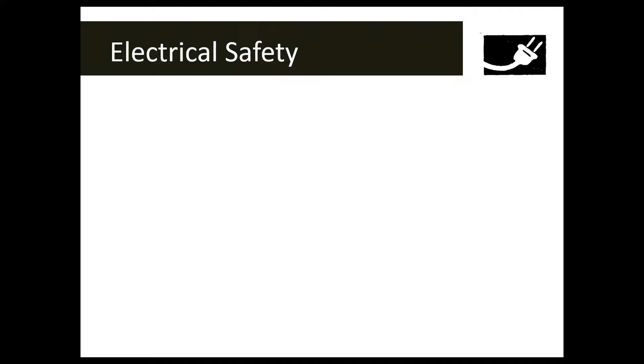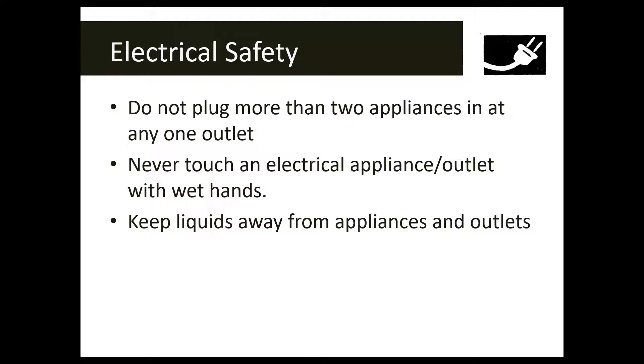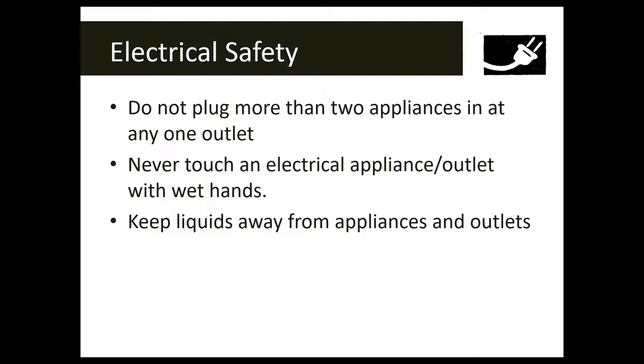Electrical safety means we're going to be working with electricity. Don't plug more than two appliances into any one outlet — we don't want to overload our electrical outlets. Never touch an electrical appliance or outlet with wet hands, since electricity and water are not friends. Keep liquids away from appliances and outlets, and keep objects such as pencil points out of outlets as well.